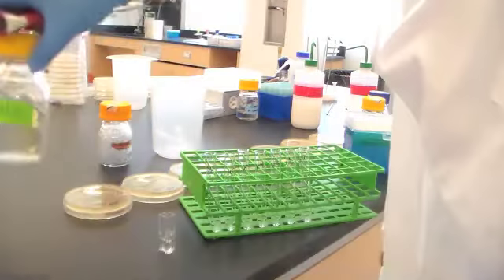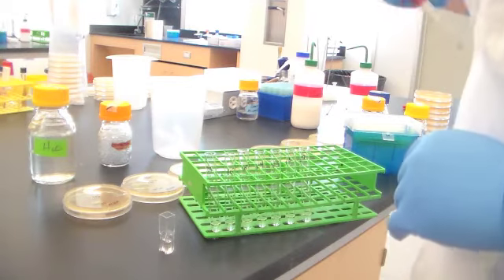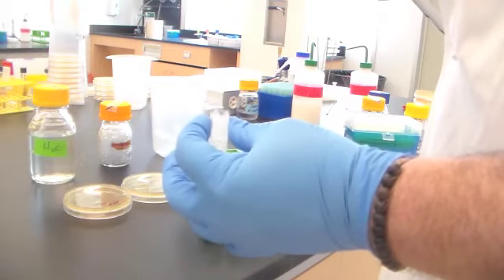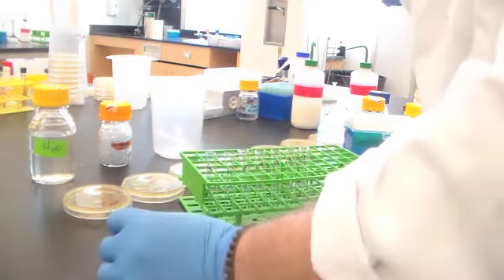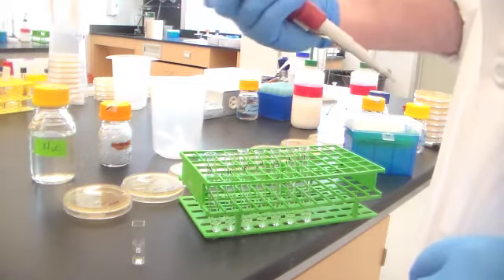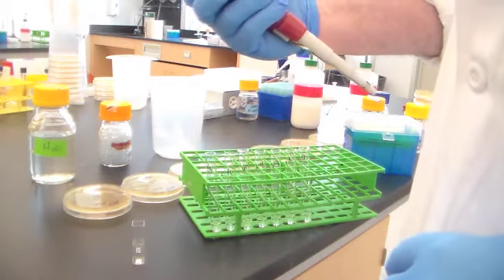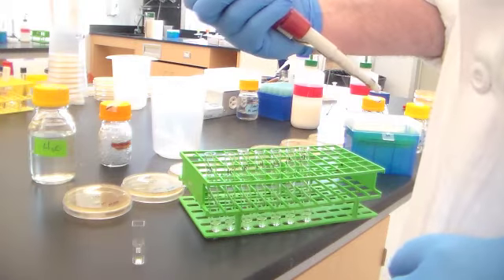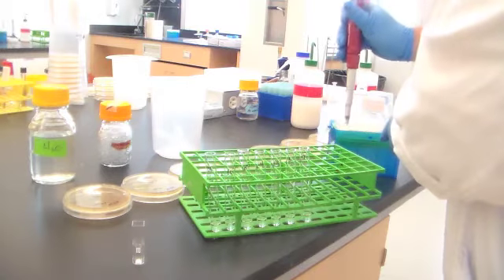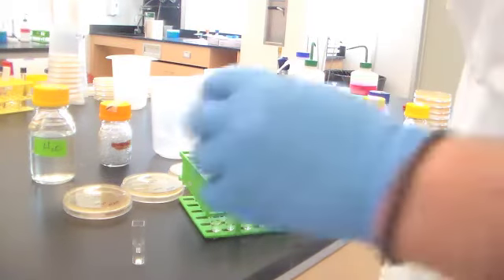Now, with the caveat that this is not the best sterile technique that you're ever going to see, I'm going to use the culture that I put into this cuvette as my starting solution to do these dilutions. The cuvettes themselves were not sterile, but as you think about this, I want you to ask yourself the question: why is Mark really not very concerned about the fact that he's potentially introducing bacteria other than E. coli into this dilution series?